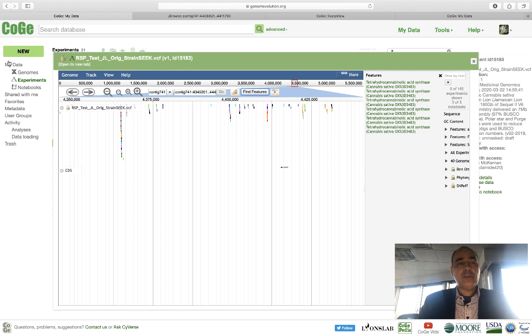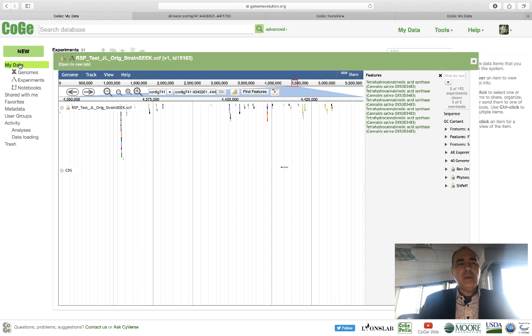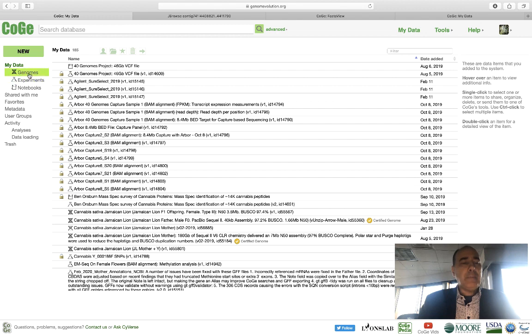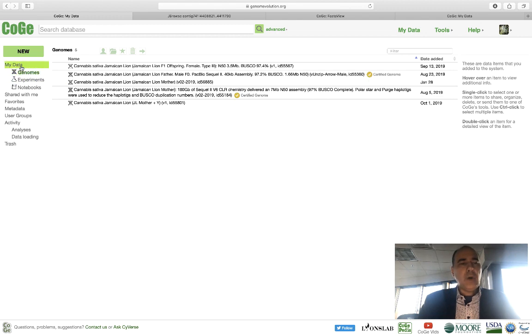If you were to actually go back, there's actually a tutorial on how to use it, so I'm going to point you to the tutorial because that's probably a better way to do it. But there are other comparative genomic tools in here, given this is the Comparative Genomics Genome Browser. If you go up to, I think, tools up here, you'll see those, like SynMap, a very good tool to do genome-to-genome alignments. In fact, let's do one right now.